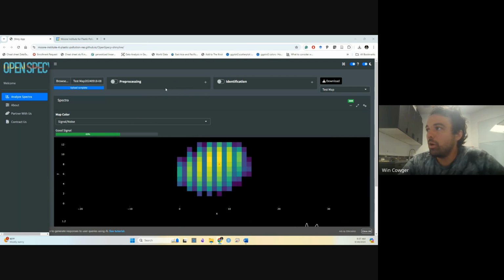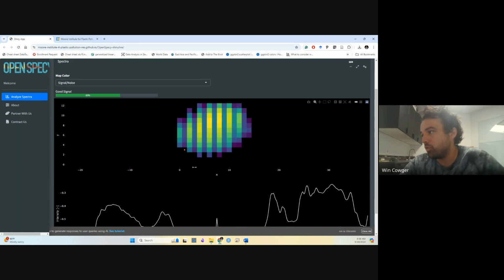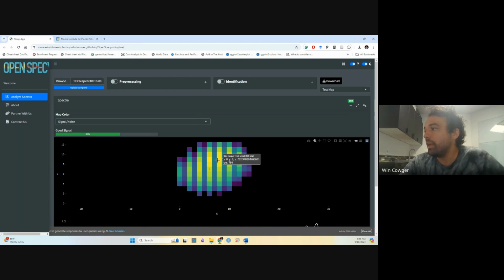All right, so once we have this thresholded image that we like, that looks like what I was expecting from my visual image, this looks like the particle that I thought would be in this hyperspectral image, there's a couple of things you could do at this point. One thing is you could just go ahead and start doing identification on it and see what you find.